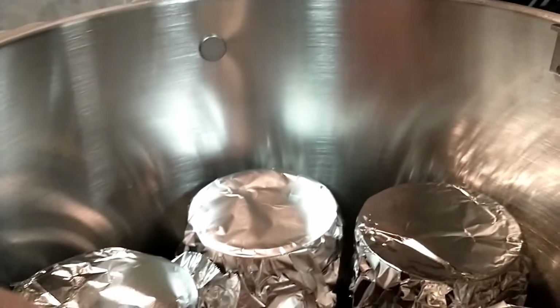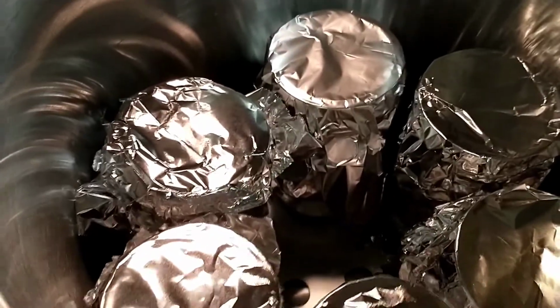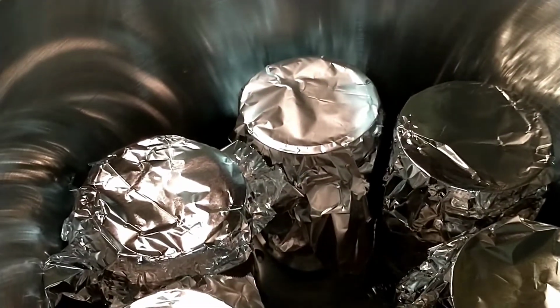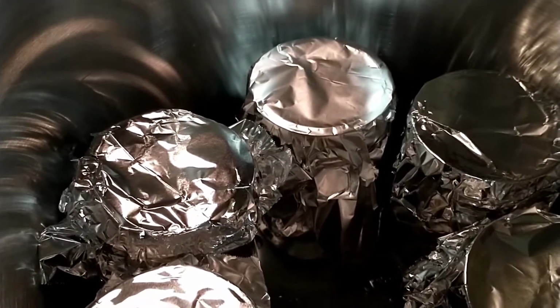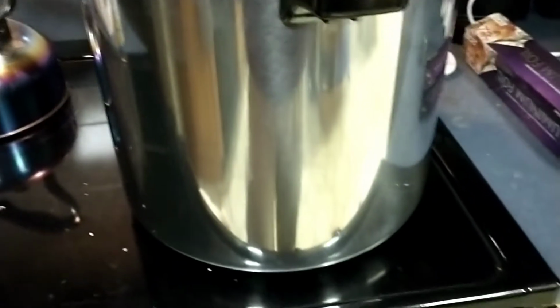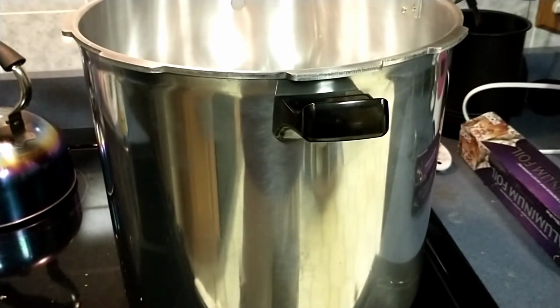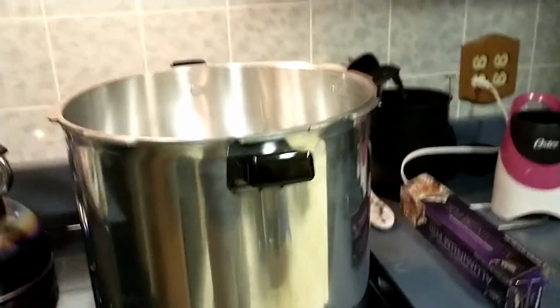Technically, with this particular canner, you can fit 9 of these in. You'd have one in the center, your 7th one there, you'd put a second rack, and then you could lay down the other 2 jars to get 9 done. But I just need 6 done, so that's what I'm doing. So the next step is to pop the cover on this thing and leave the weight off, bring it up to a boil so that the steam valve here.